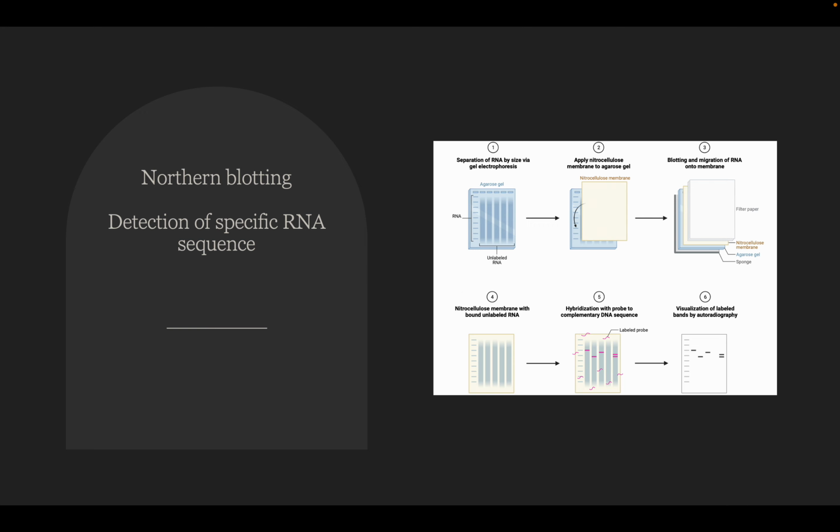Whenever you are working with RNA, make sure that you clean your bench area very well with RNase-free water and everything, and make sure that there is no RNase around. Otherwise, you will not see any band in this agarose gel. So be careful when isolating RNA. Always use fresh gloves, clean your bench area, and always try to use RNase-free water.